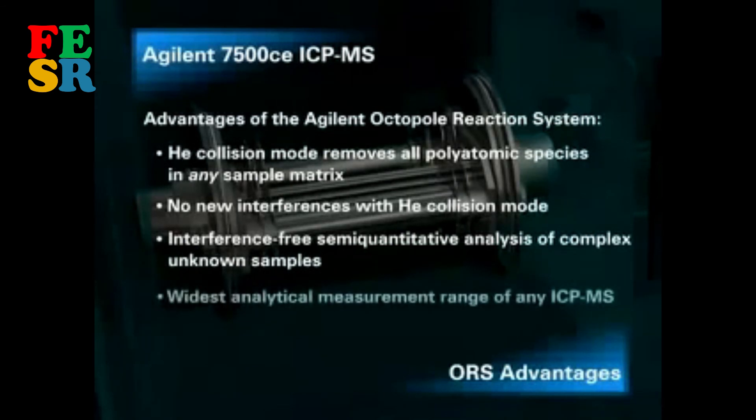The 7500 CE can measure mercury at single-figure parts-per-trillion, plus sodium at greater than 1,000 parts-per-million in the same analytical run.